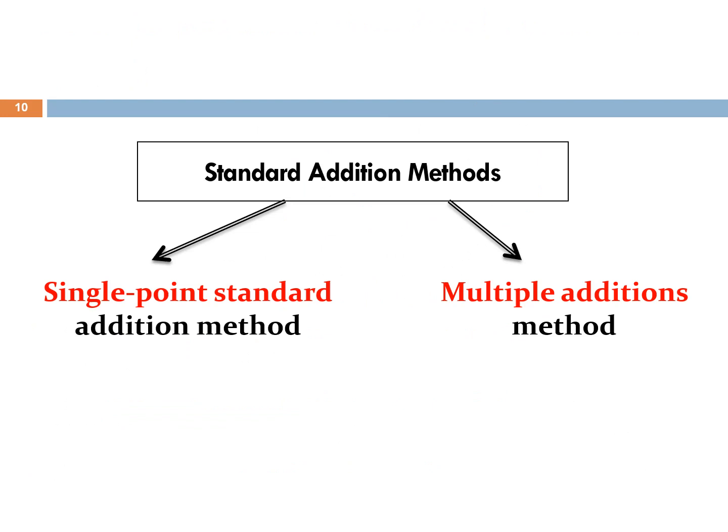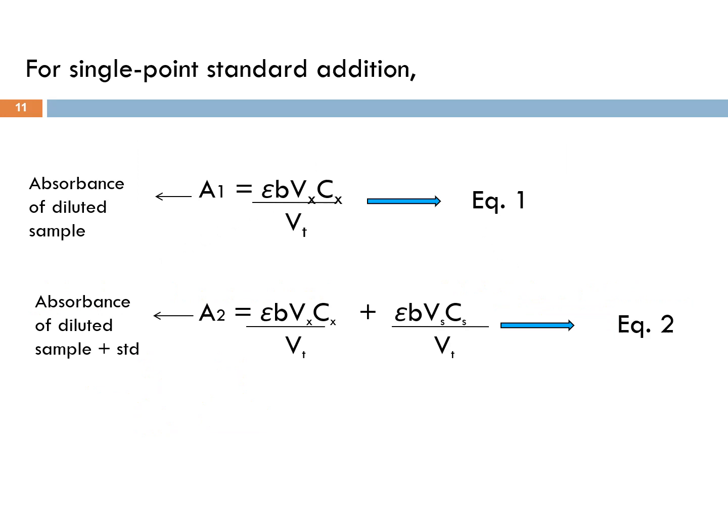Okay, for standard addition method, kalau kita guna dua volumetric flask, satu kita letak kita punya unknown sample je, satu lagi barulah kita letak kita punya standard solution. Okay, so ada one increment of sample, we call it as single point standard addition method. Untuk multiple addition ni, yang macam tadilah kita add different amount of standard inside the volumetric flask.